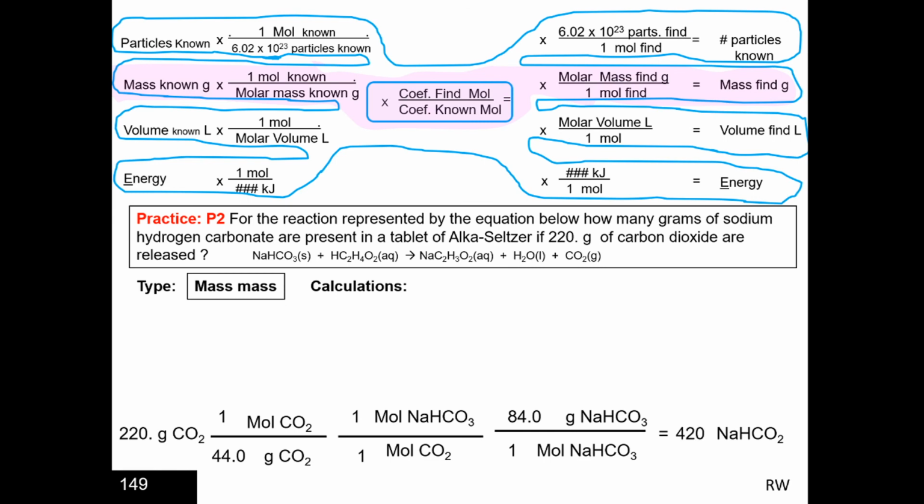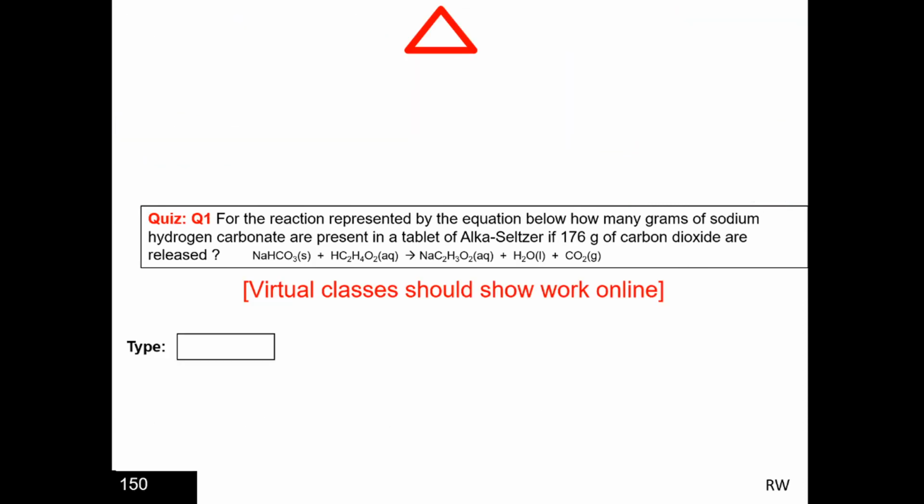420 grams of NaHCO3. That's a typo on the screen; it should be NaHCO3 there. All right. Make note of that.